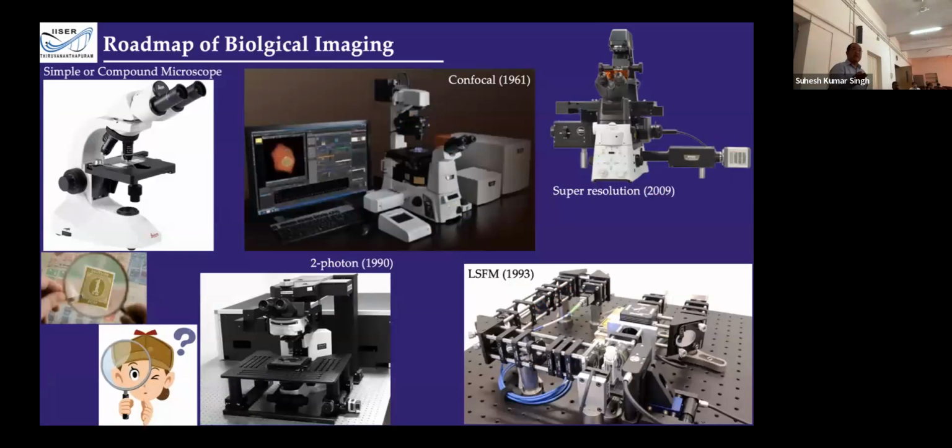So in this way, today I will focus on the biological applications and the clinical applications. Before going in depth about imaging for biological applications, I would like to say that biological imaging has a deep history. Since time immemorial, we have been quite familiar with imaging, not with present day-to-day technology but with our naked eyes. Then we used a single magnifying lens, and then the simple microscope came, and slowly it came to confocal microscopy in the 1960s, and then in the 1990s two-photon imaging, and then super resolution in 2009. This is the state of technology as far as imaging is concerned. So today I will focus on LSFM. Of course, you are quite familiar, and you have been shown about super resolution also.